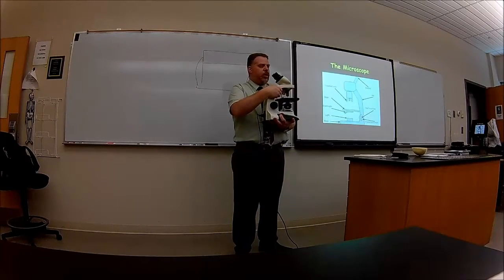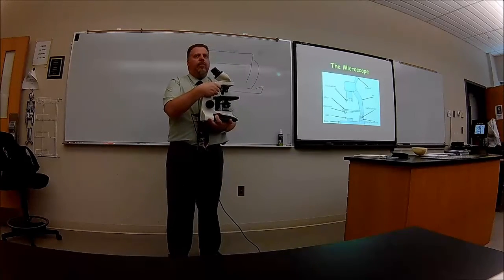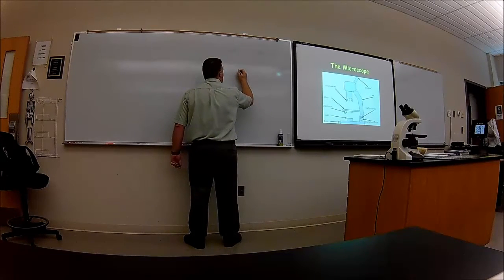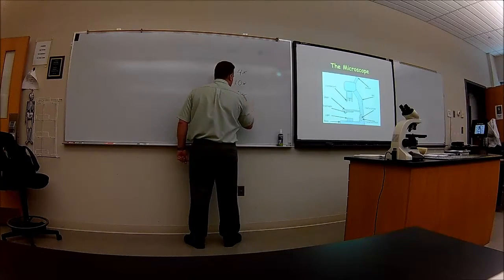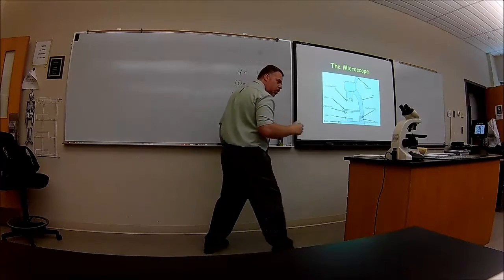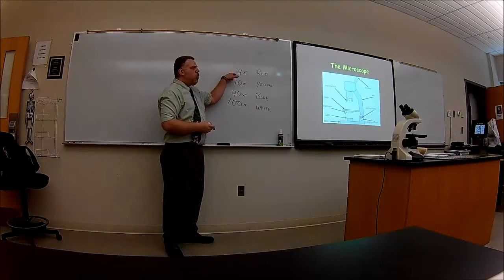You also have this — it's called a turret, or a nose piece. You can see there's a bunch of different lenses, long lenses that are on there. You usually have four. These lenses are called objective lenses, and they have different magnifications on each one. They're colored, and they're universally colored. The objective lenses are going to be 4x, 10x, 40x, and 100x. The 4x will be very short; the 100x is the longest. The numbers will be on those objective lenses.